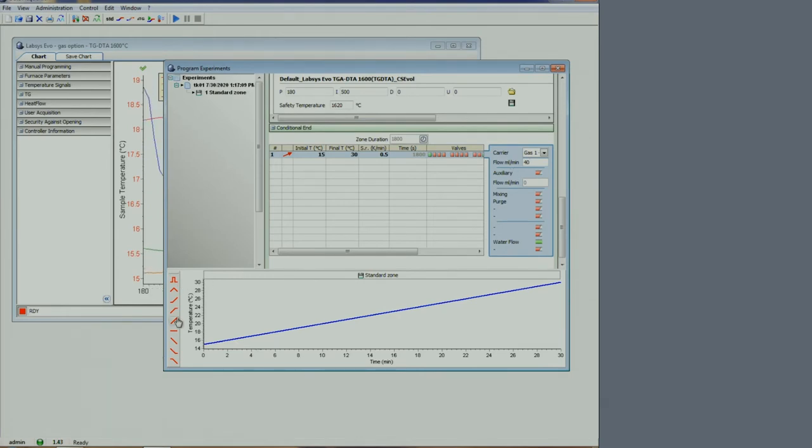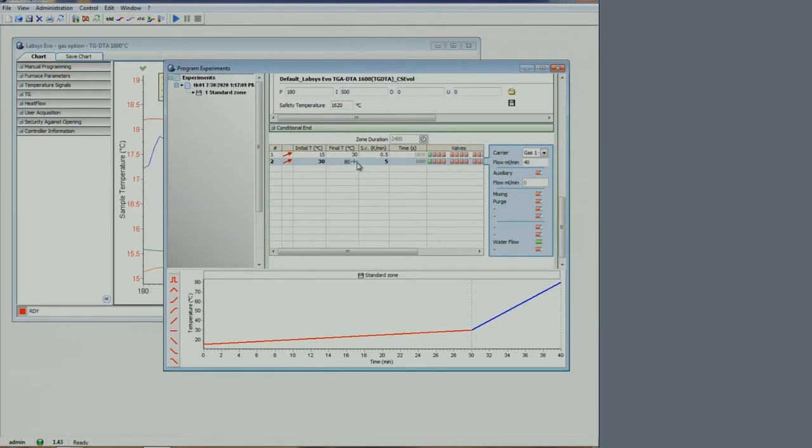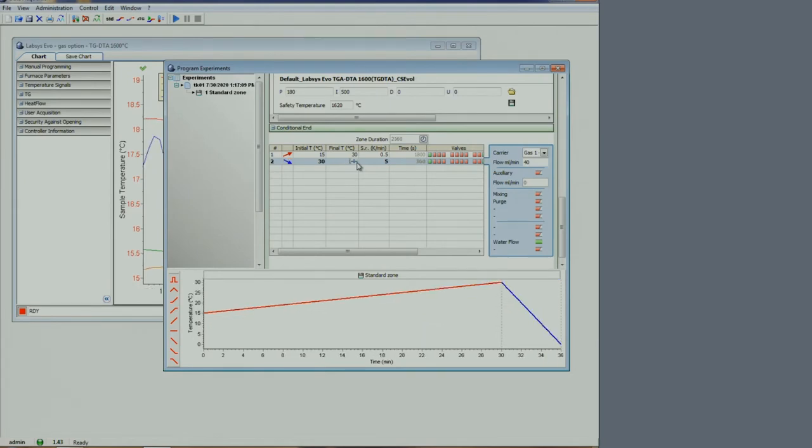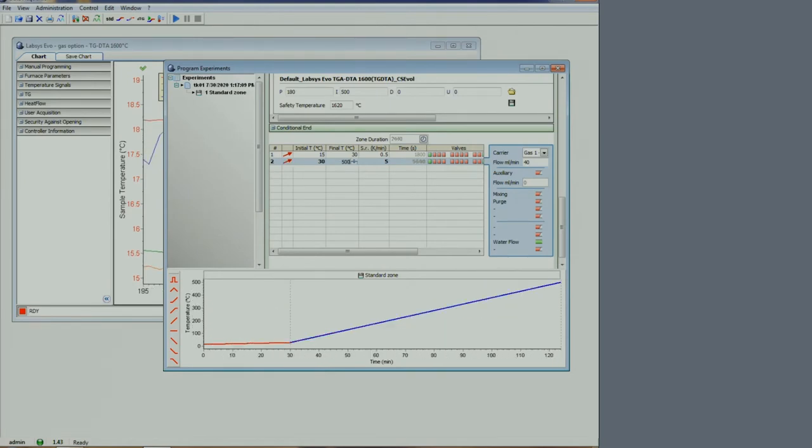We can now add our next step. Let's set a final temperature. The temperature and ramp rate can be set to your experimental needs. The maximum ramp rate is 20 degrees per minute.